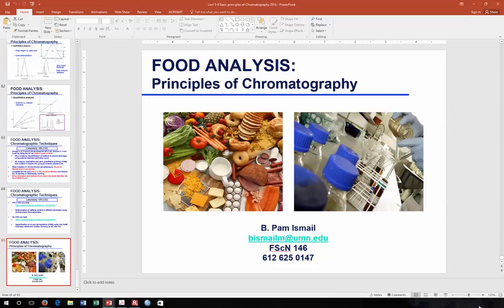Perfect. We're done with basic chromatography. Let's move on to HPLC.